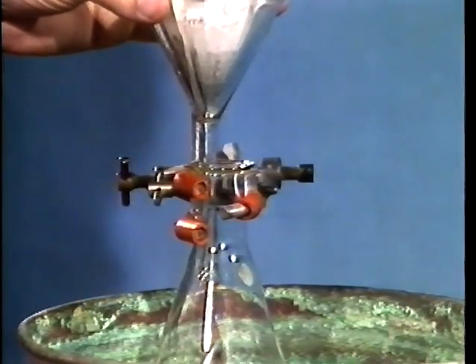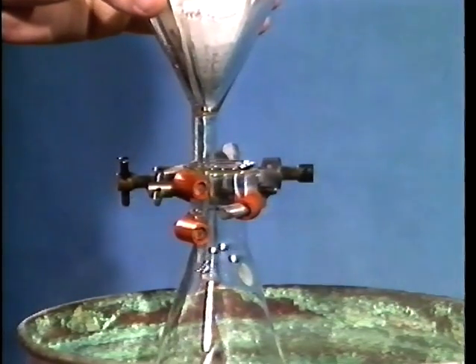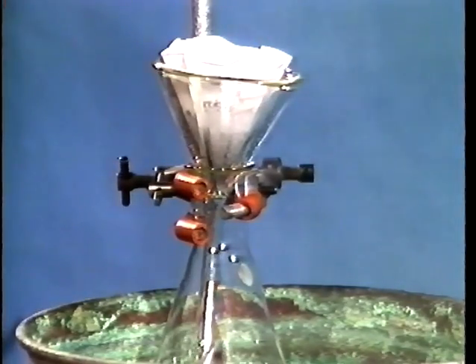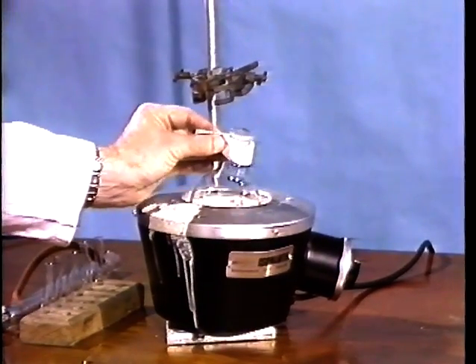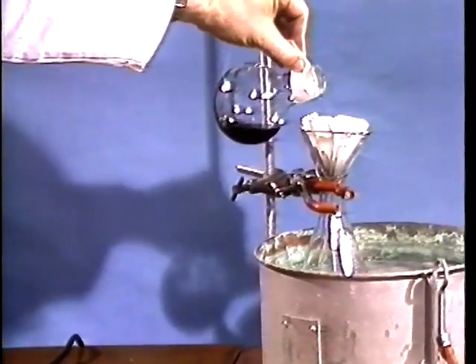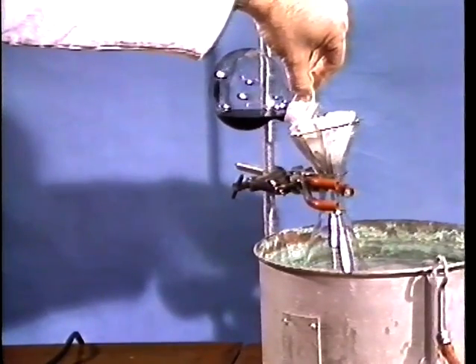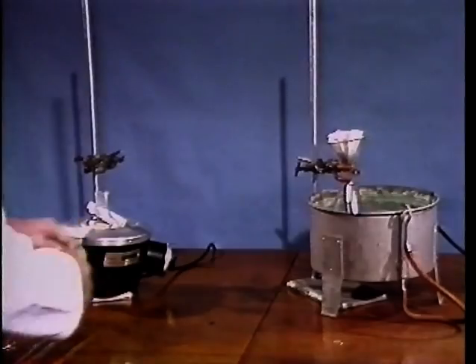Filtering in small portions helps prevent the insoluble material from creeping up the side of the filter paper and over the top and back into the Erlenmeyer. It also helps prevent crystallization occurring in the neck of the filter funnel. Repeat the process of pouring small portions into the fluted filter paper until the filtration is complete.